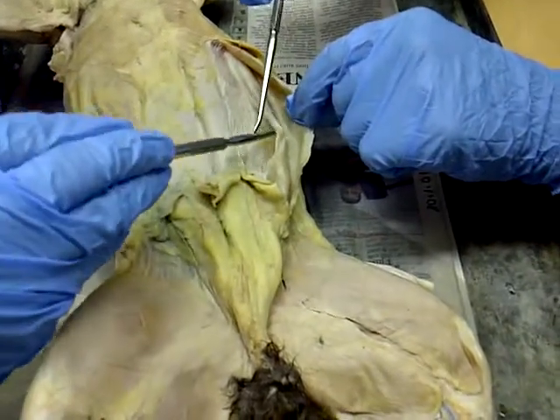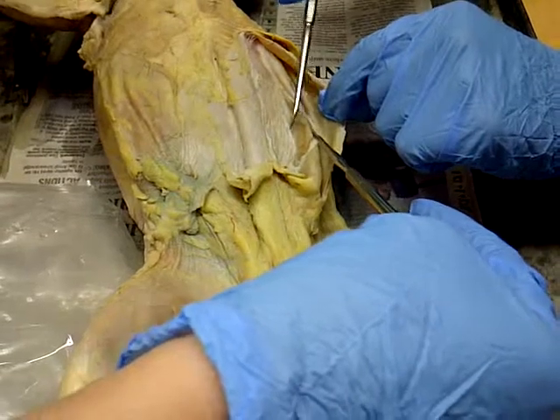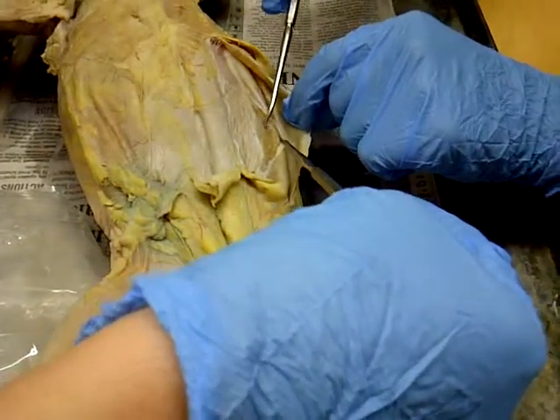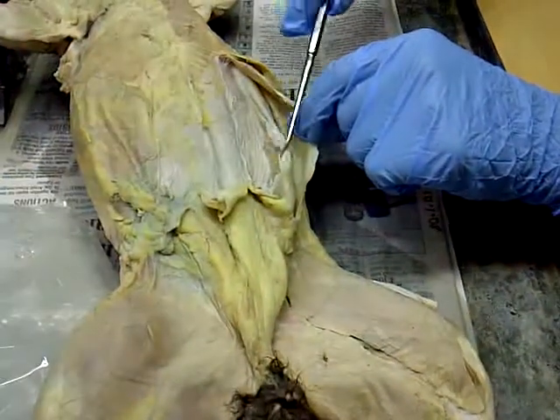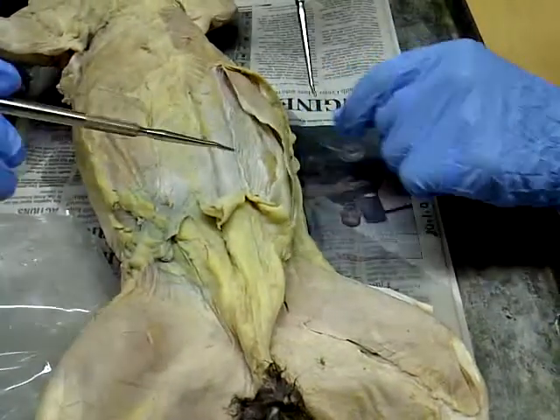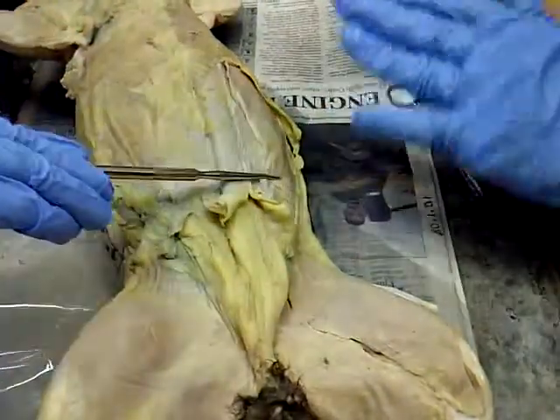And inside here is the transverse abdominis. Sorry, I said oblique by accident. It's the transverse abdominis, not the oblique. So that is what we have to memorize for the abdominals.